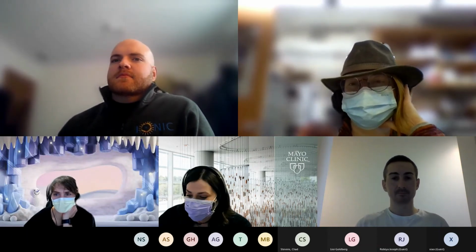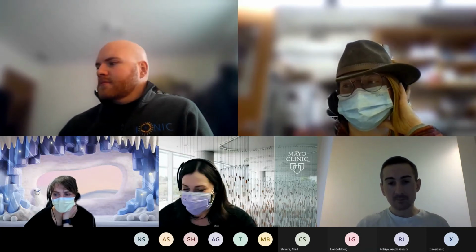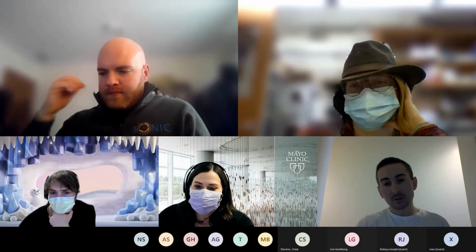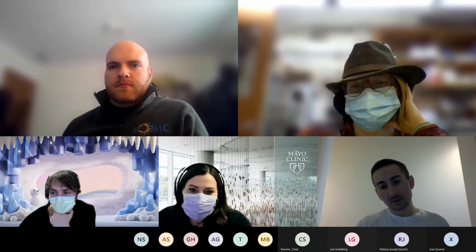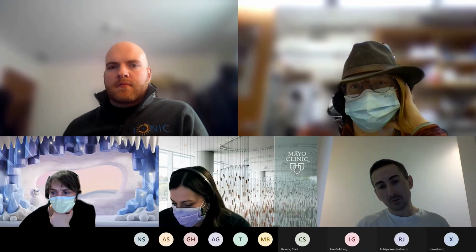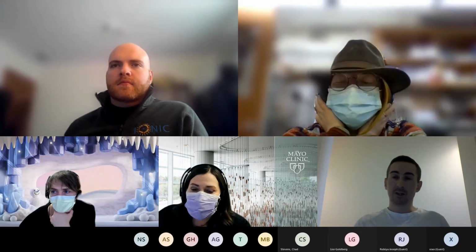I just have some expertise in platelets, not really in cytometry. A few of us are here from the special coag lab at Mayo. As far as platelets go, pH can be a concern when you're pre-analytically handling them. I was curious if the stains within the cytometry process are looked at for that, given the effect on cells over time with open tubes, or the few 30-minute spins. Is there a concern that the pH could change and be a variable in sample performance? It's possible.